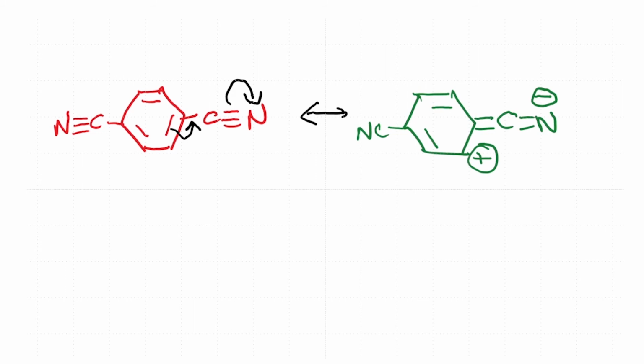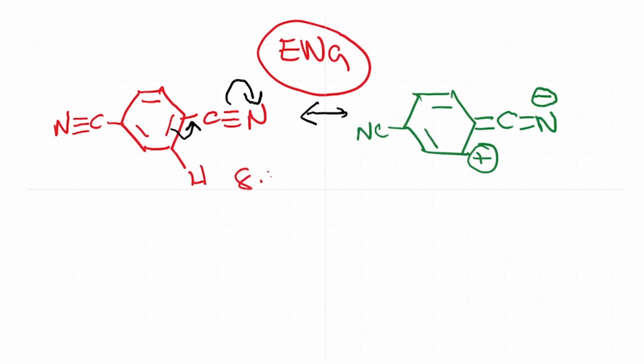Again, this is an electron withdrawing group, and therefore it is going to make it more deshielded. I'm sorry, I forgot to tell you the chemical shift value. The chemical shift value is 8.10. Okay, so clearly the nitro has a stronger electron withdrawing ability when compared to cyano, and so cyano has a slightly lower value in comparison with the nitro group.